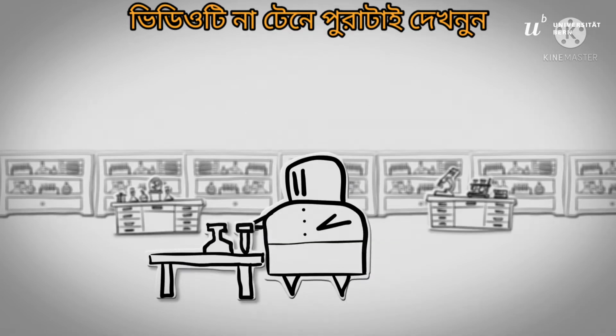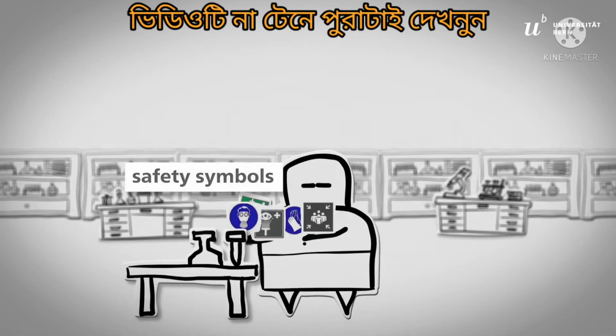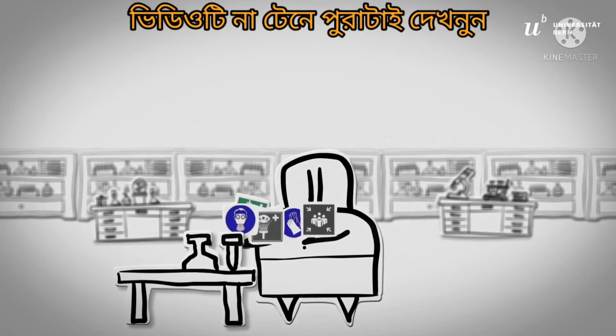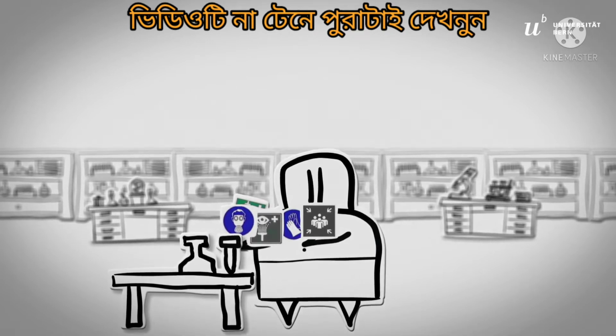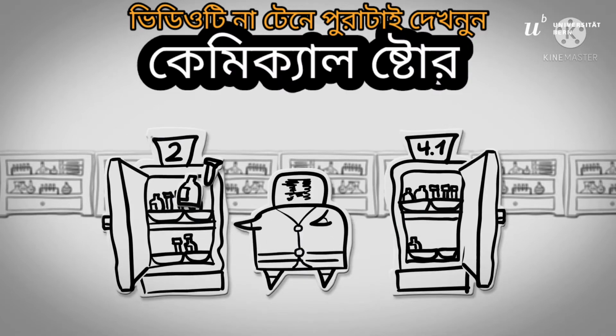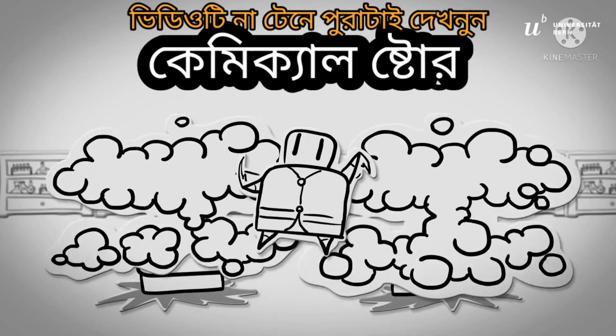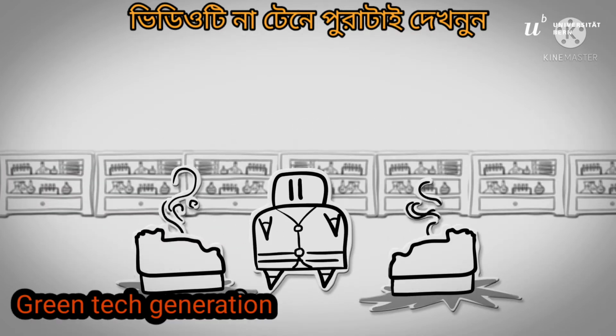When working in the laboratory, you must be familiar with the safety symbols and be able to locate and use all emergency facilities. Store chemicals from the same storage class together. Chemicals that can react with each other must be stored separately.